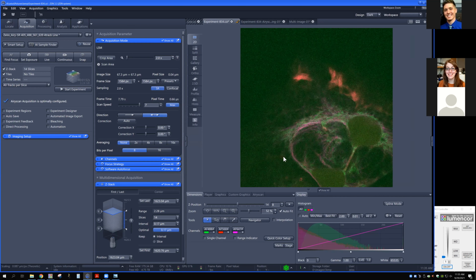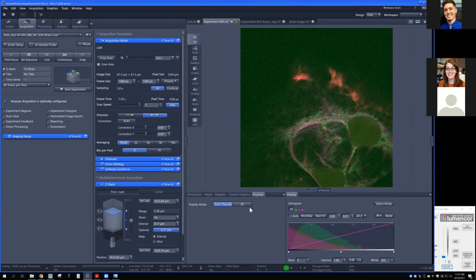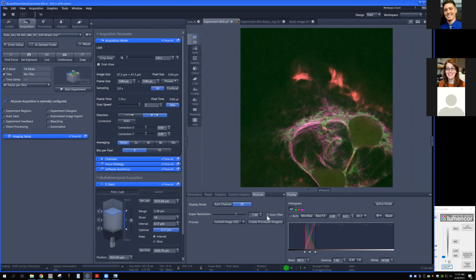This value that we had in our Airyscan tab right here, I set it to auto so that it could just determine where it thought the best cutoff between signal and noise is, but we can also set this manually as well. And especially if we want to compare two different kinds of images or two different images in a series, we likely want to keep that deconvolution strength the same for everything. And so, we can manually adjust this.